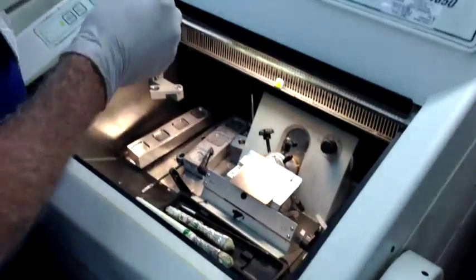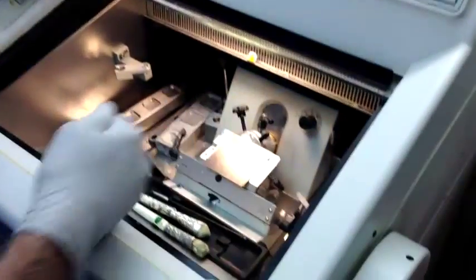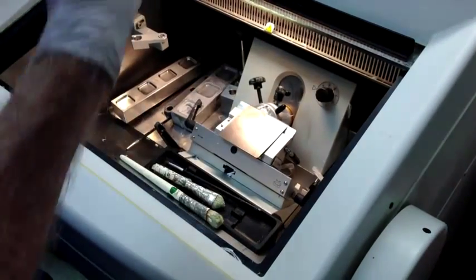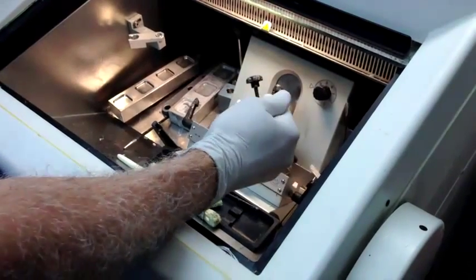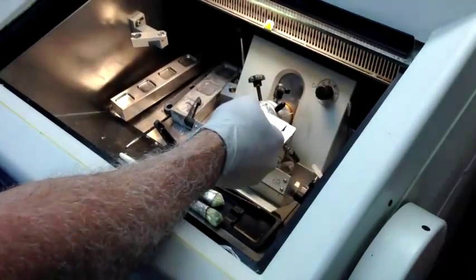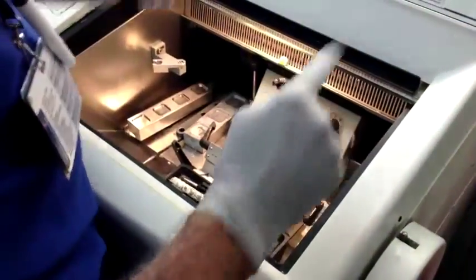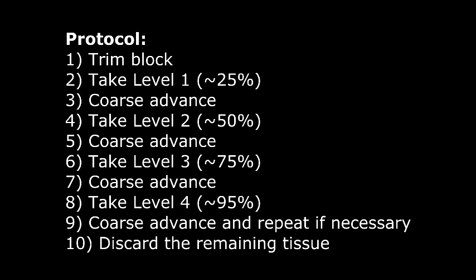So roughly, the idea is: if you're going to exhaust, you get a full face, 25% of the way in, then you go 50% of the way in, then 75% of the way in, and then after that you go almost to the very end — there will be a little bit of tissue left, but not a whole lot. Typically, once you've exhausted a specimen at that 90–95% level, you don't save it for permanent.